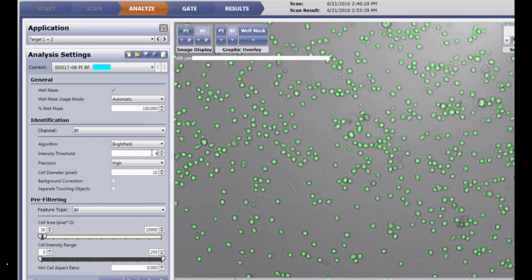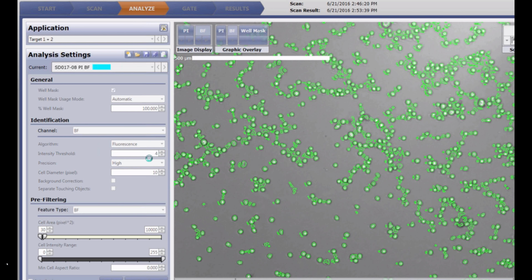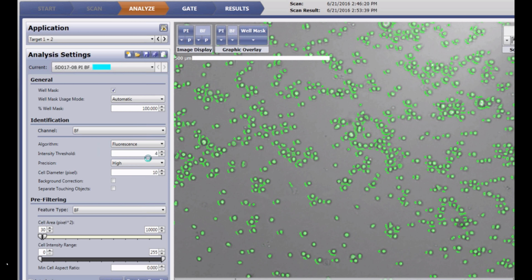So we've covered a lot on this bright field. What I want to try now is show you how the fluorescent algorithm, which you know functionally how it works, but how can you use it on a bright field image? It's just more of understanding how the algorithm works. Because the fluorescent algorithm is looking for very, very bright objects. As you remember the profile of that fluorescent cell, we can use that for these bright, bright suspension cells.